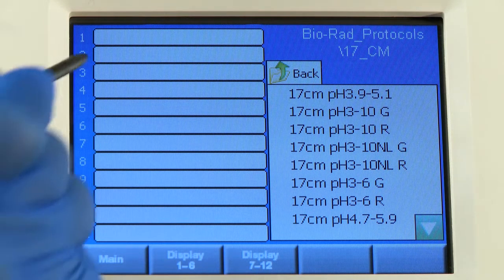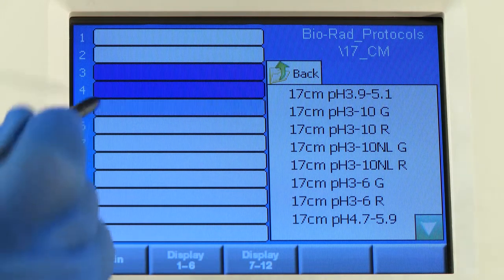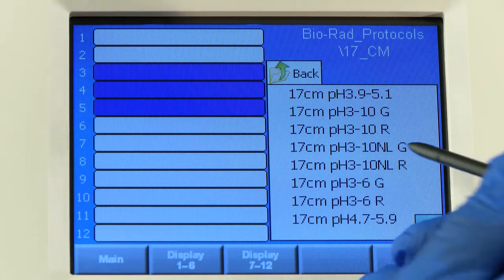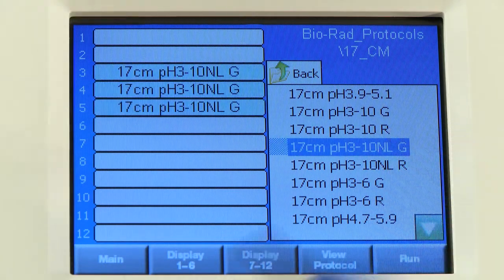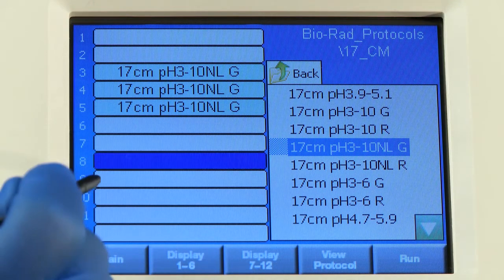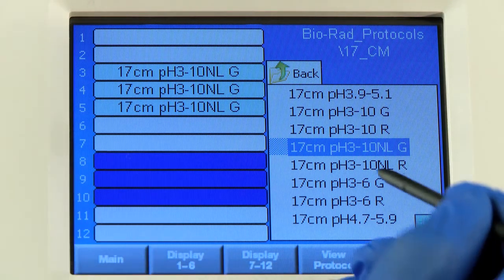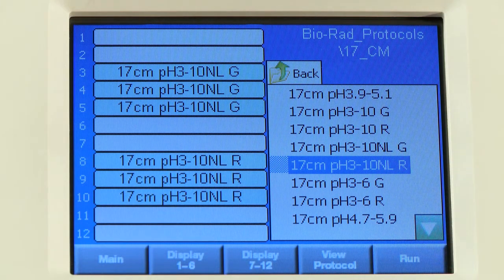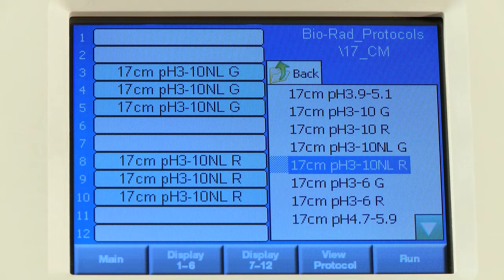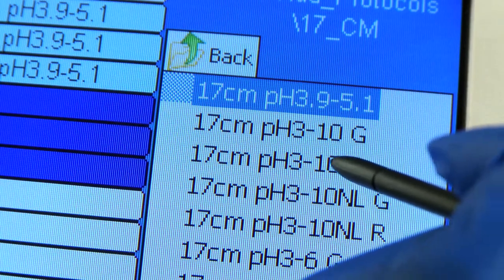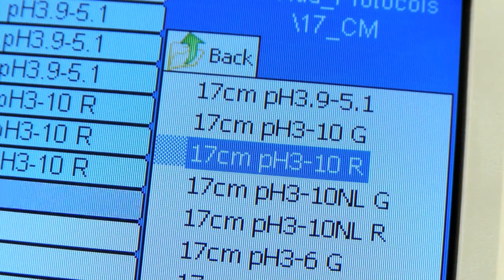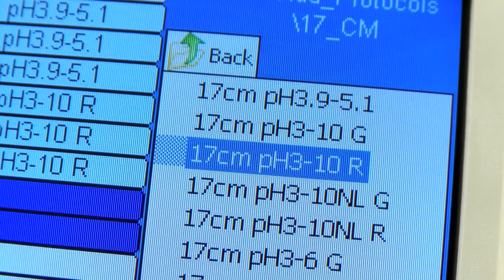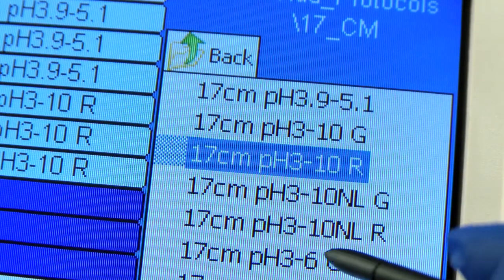Touch the lanes you would like to populate with a specific protocol. Then, touch the desired protocol to populate the lane. Continue this process until all of the lanes you would like to run are populated with the protocols of your choice. Because all lanes are controlled individually, different samples, pH gradients, and protocols can be run simultaneously.